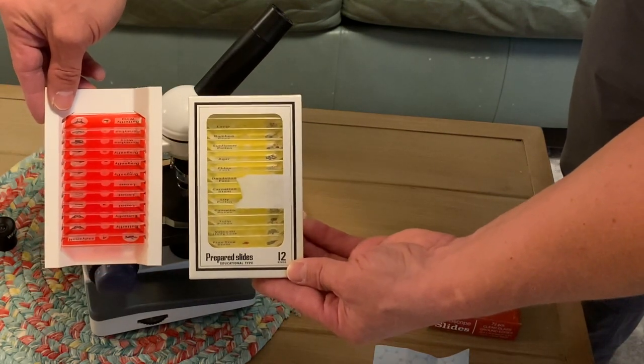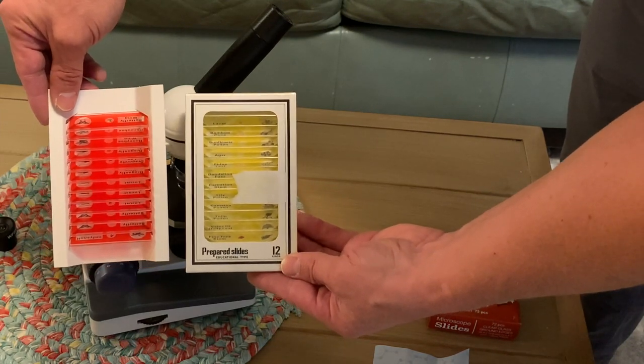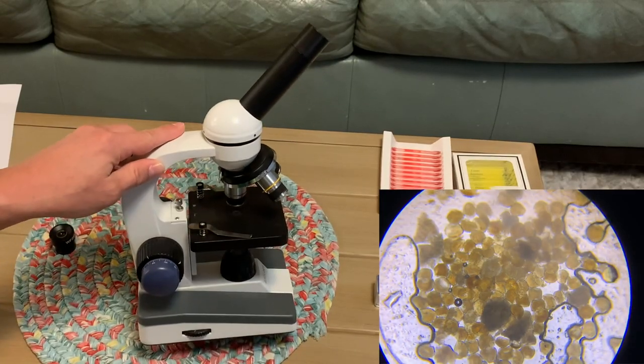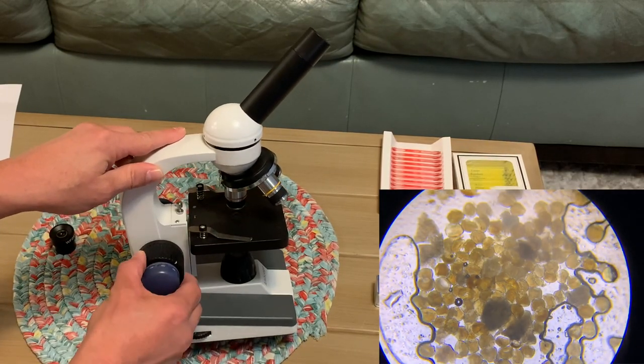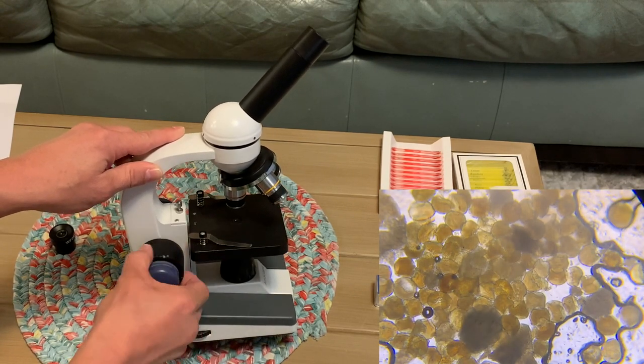We're going to be looking at some bee's legs and a couple of other items on these prepared slides, and I also made a slide with yogurt that I made myself. So here are the basics of how this microscope works. You've got your big knob here that brings your lens closer and further away.